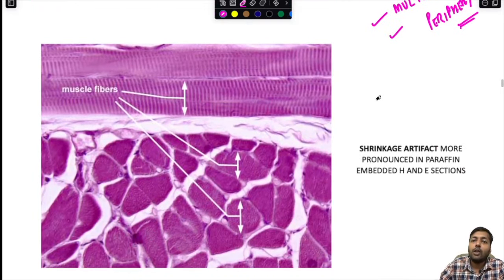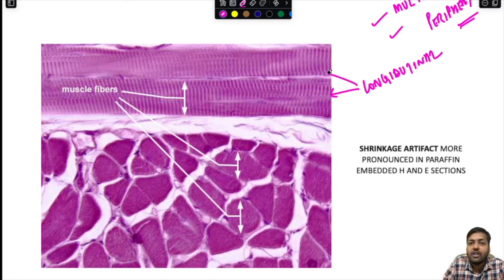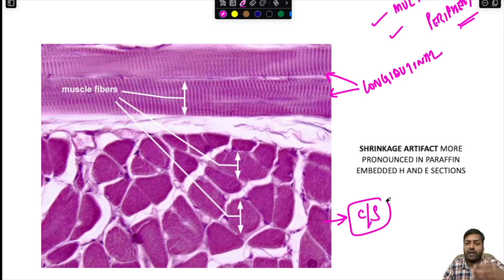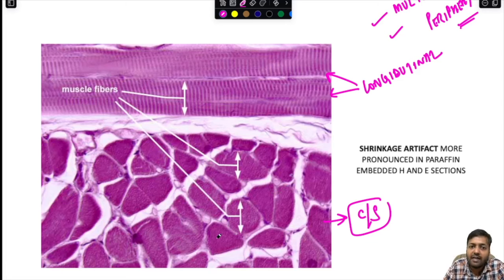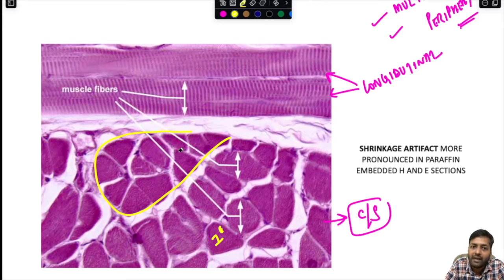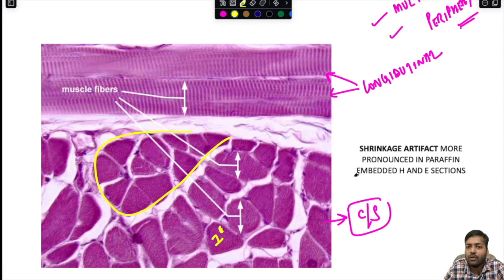This is the longitudinal section of skeletal muscle, where you can appreciate the cross striations. The cross section is obtained by cutting the muscle transversely. In the cross section, individual muscle fibers surrounded by endomysium are visible, and a group of fibers is surrounded by perimysium. They are polygonal in shape, multi-nucleated with peripherally located nuclei. Note that spaces visible between muscle fibers in this section represent a shrinkage artifact.